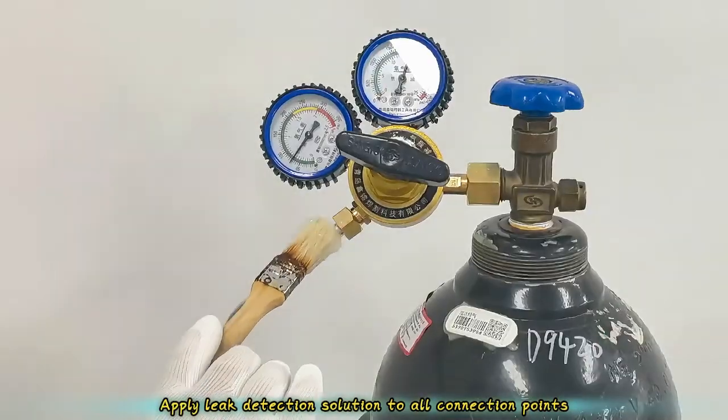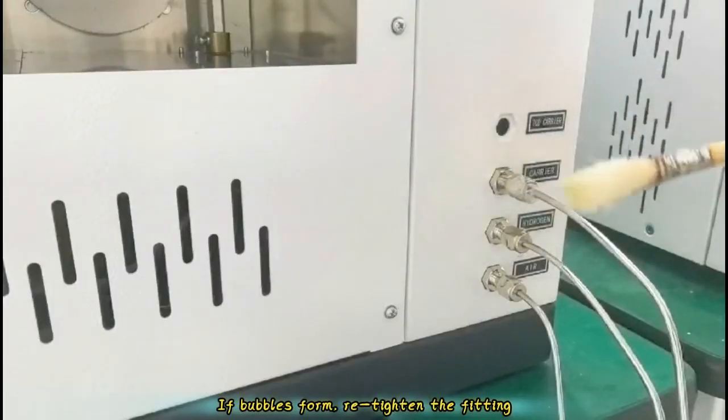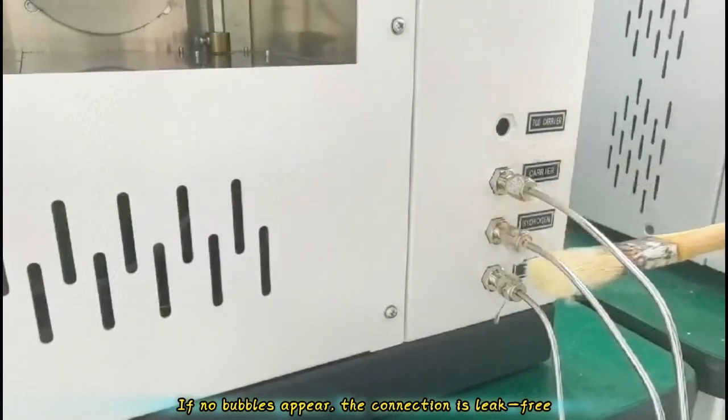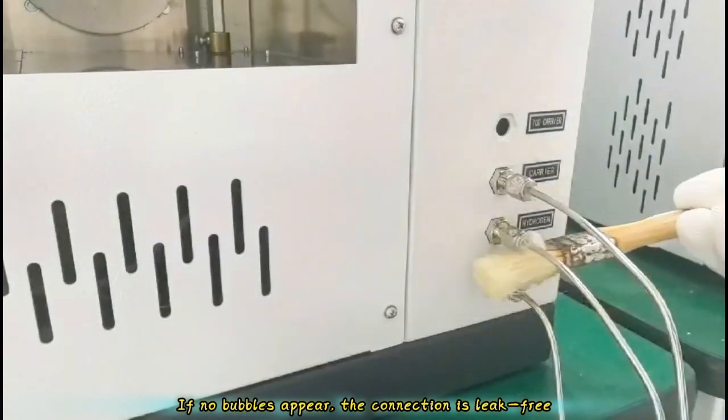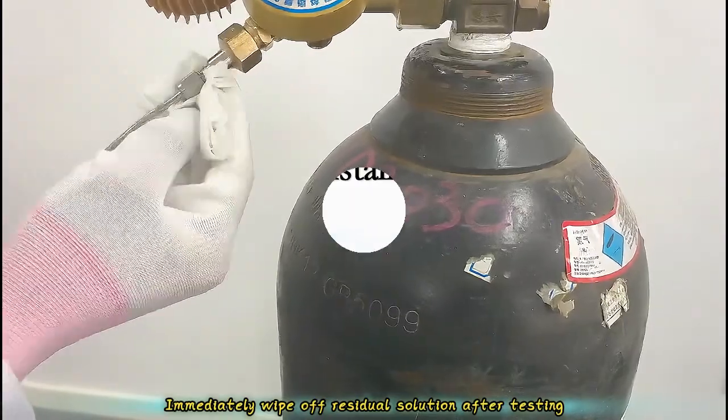Apply leak detection solution to all connection points. If bubbles form, retighten the fitting. If no bubbles appear, the connection is leak-free. Immediately wipe off residual solution after testing.